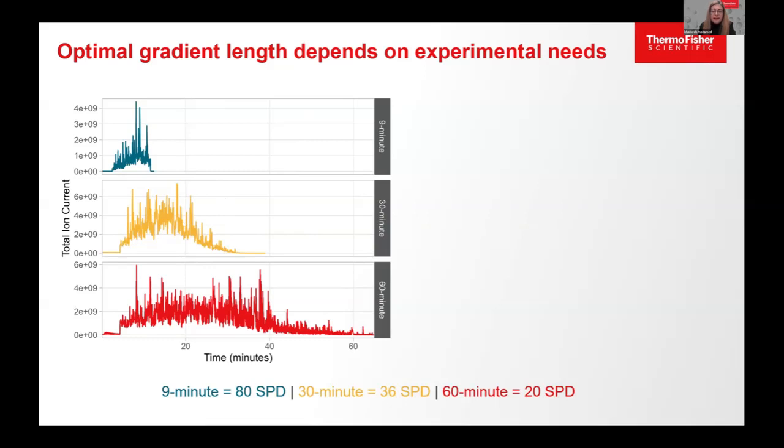It means if you're doing ID, you can always go fast. It gives you even 5,000-6,000 proteins. But if you really are looking to see biological changes, like subtle changes of 1.2 fold, I recommend not going shorter than a 20-minute gradient on DIA using this chromatography.